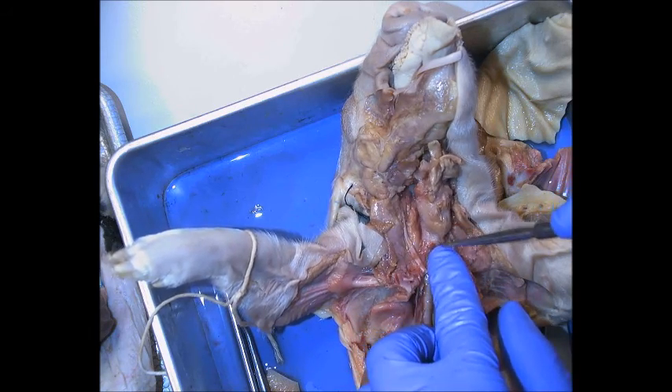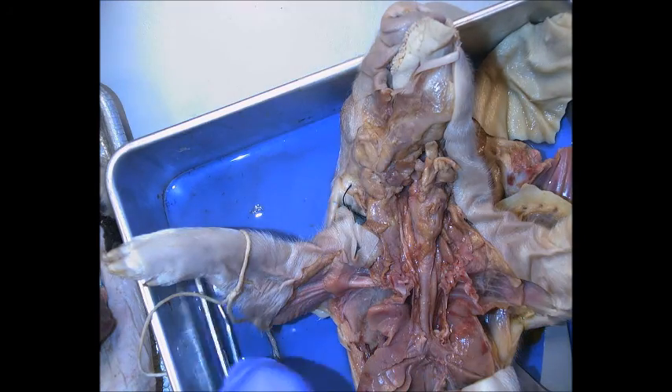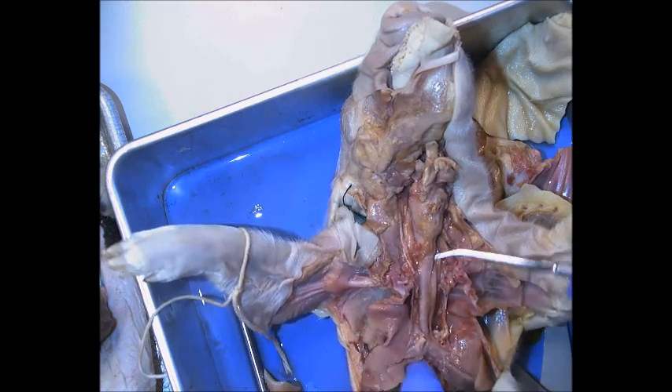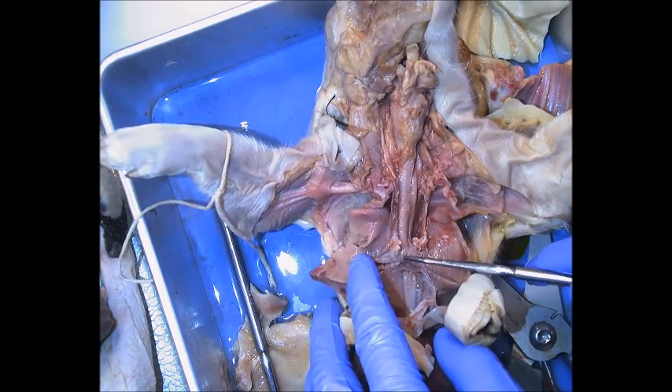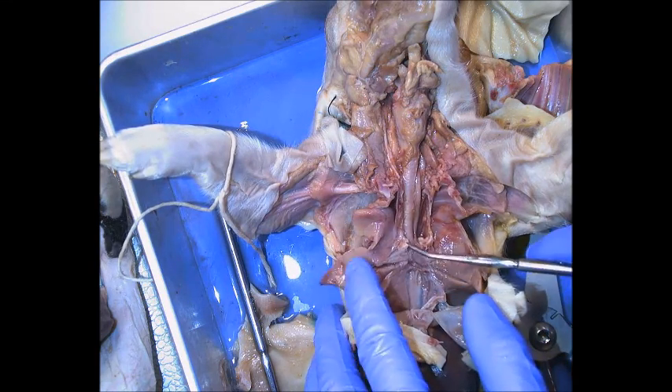The very first ring of cartilage on the trachea is the cricoid cartilage. The soft spot between the two is the cricothyroid ligament. Follow the trachea all the way down and you'll see it splits — that bifurcation point is the carina.